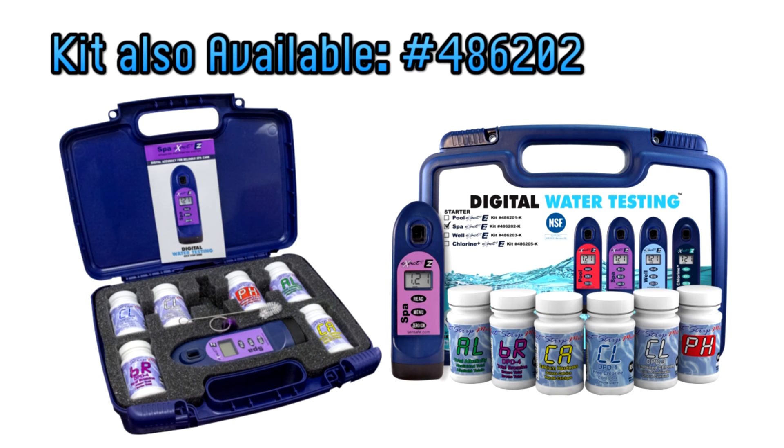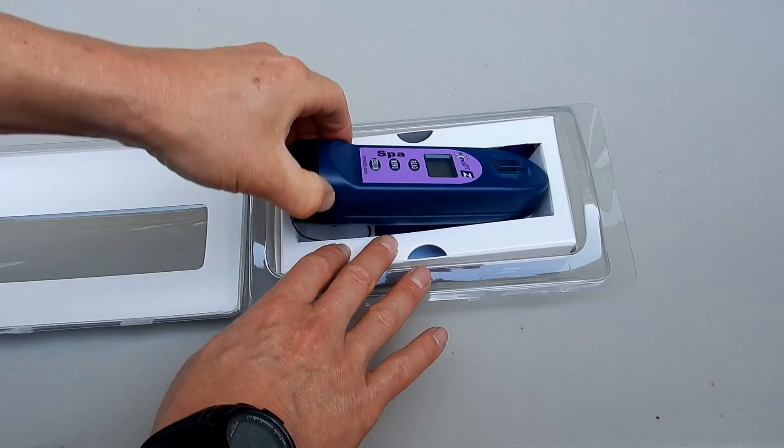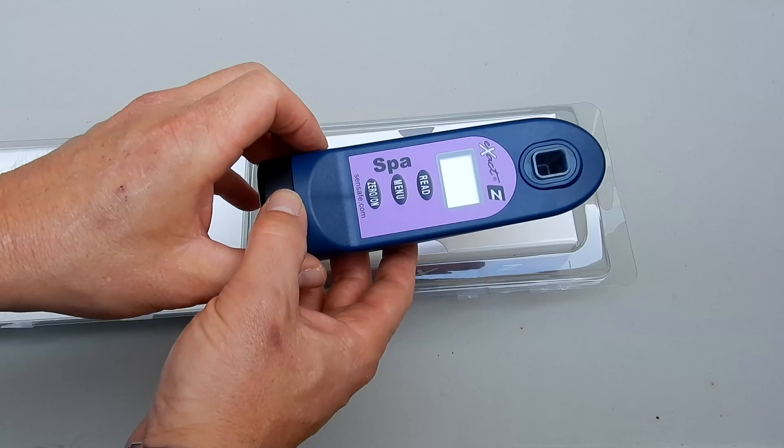It is also a kit available that comes in a hard plastic case that contains 25 tests of each of these test factors including bromine. And inside the box is the Spa Exact EZ photometer.